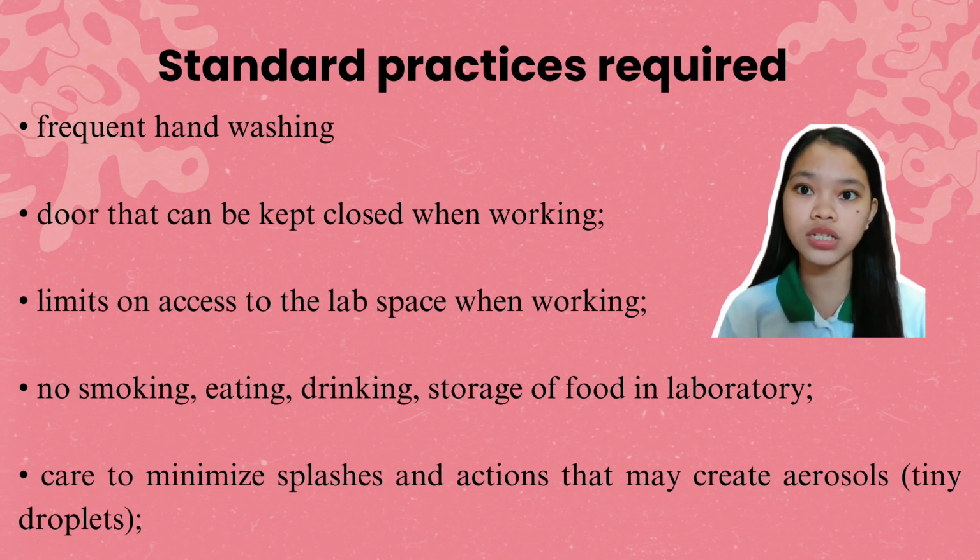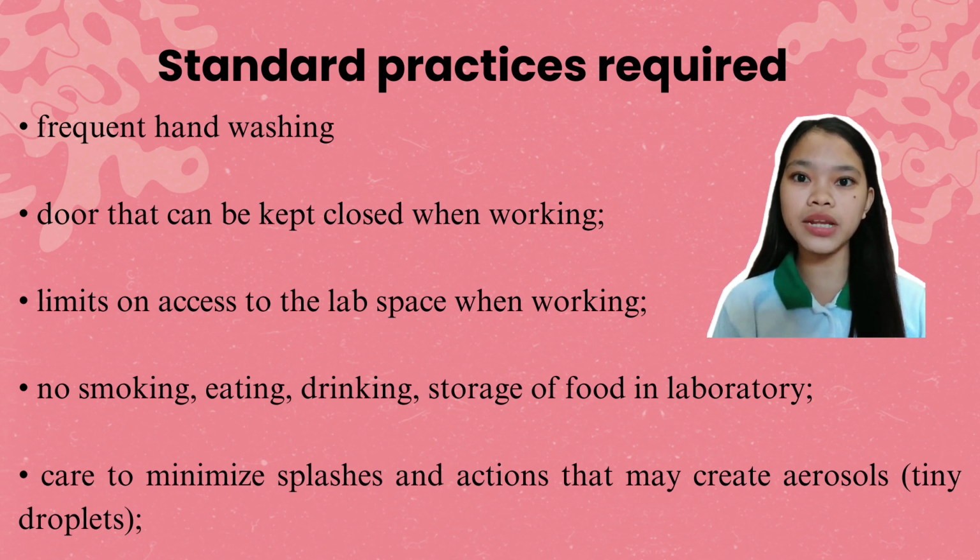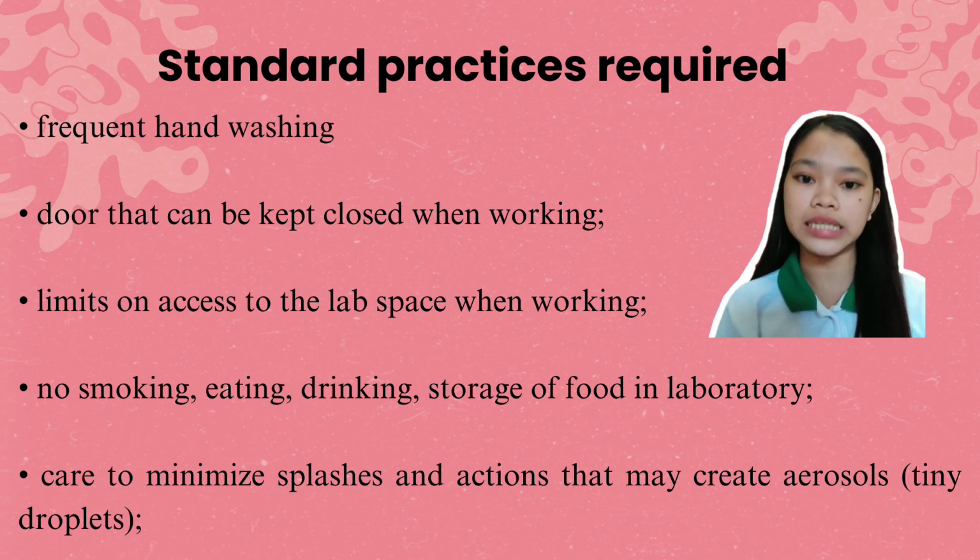First, frequent hand washing, doors that can be kept closed when working, limits on access to the lab space when working, no smoking, eating, drinking, or storage of food in the laboratory. Care to minimize splashes and actions that create aerosols. The decontamination of work surfaces after every use and after any spills.